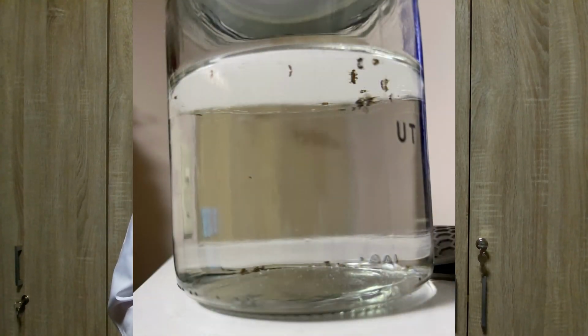Alcohol is used to clean a specimen or it can be used as a killing agent, but most importantly, it acts as a preservative. Once the desired specimens have been collected, any live ones will be transferred to a killing jar, which consists of cardboard on top of cotton balls that are soaked with a fumigant, meant to immobilize and suffocate the specimens and minimize any damage done to their bodies. For preservation, the specimens can be stored in vials, where the specimen is submerged in 70% alcohol.